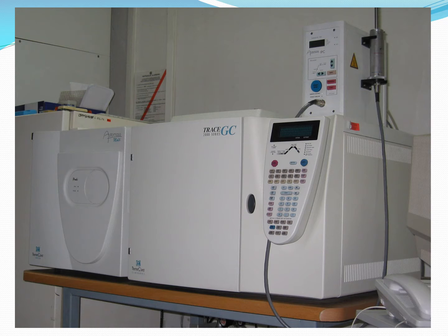This is a photograph of a gas chromatograph.